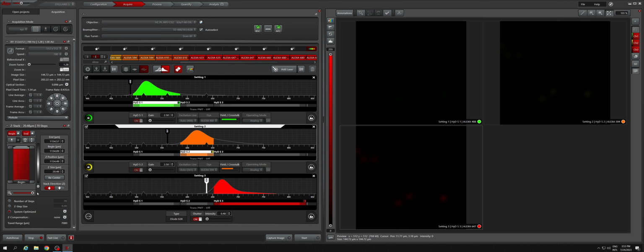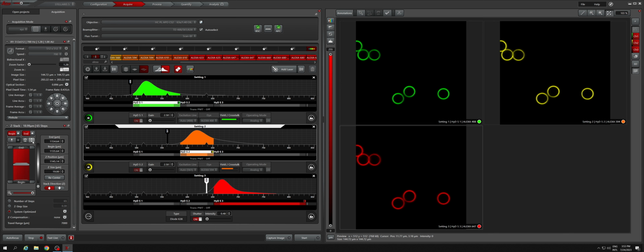So if you move this zoom slider, it expands it out, and now you can see the whole thickness of the Z stack, and you can move this slider up and down to any point and quickly kind of jump to that point in your stack. And you can also hit this icon, move to center, and it'll jump straight to the center. So you can check again, everything's okay.